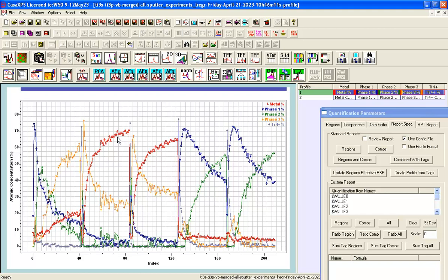In fact, these all represent argon sputtered titanium foil samples, and the first one is 200 eV, and so we don't see the rapid movement into the metal, whereas we do in the case of the 2000, and this is the 1000, and you can see that the 1000 produces the metal at a slower rate than the 2000. So these argon sputtered samples behave in a systematic way as a function of the energy of the argon ions, certainly in the case of the metal anyway.